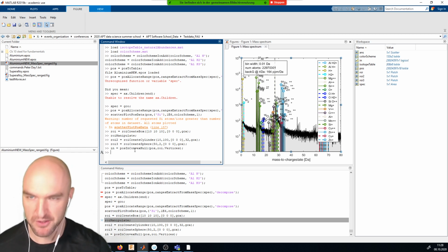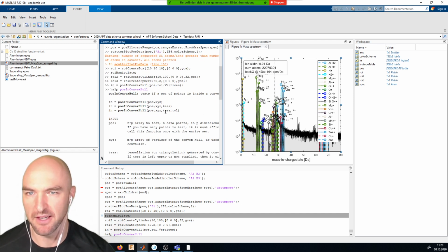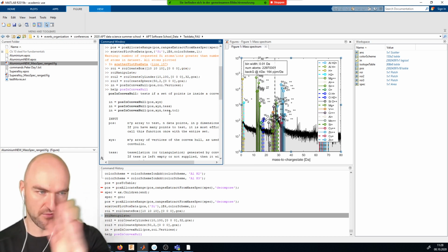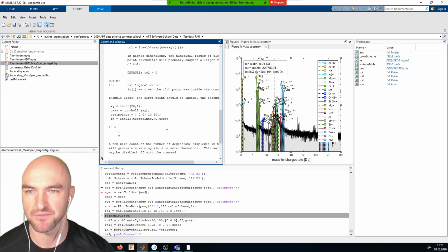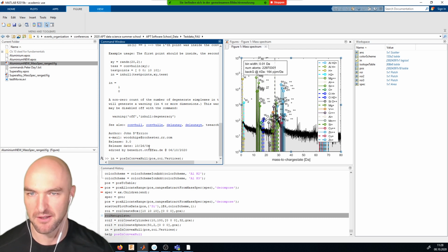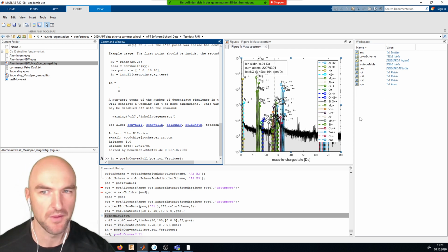I'll just show you the options. You can also provide a tessellation, which is not important, and a tolerance, so that if you have points that are very close on a boundary, you can take into account that they have some tolerance to be inside or outside. But we are not going to use it very much. Almost all of what we need is essentially just the pos variable and the ROI's vertices. And then you can see that we have a logical variable.